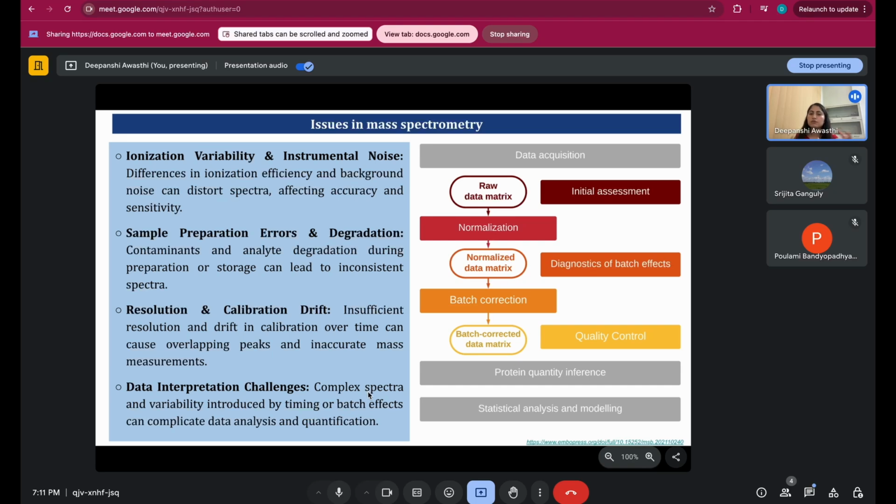So firstly you have to see what the entire mass of the fragment is, then you have to label what your Y6 would be. It depends on how many residues long the peptide is. So you have to label that this would be my Y6 ion, this would be my B1 ion. If the spectra is complicated and your interpretation is wrong, then your analysis will also go wrong.